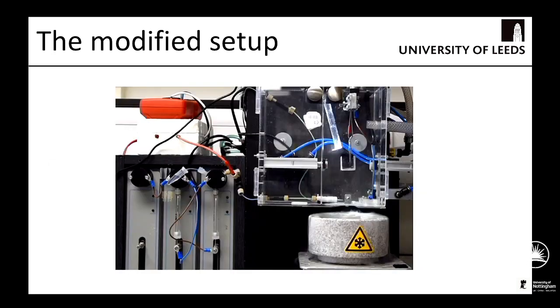And so what does this thing look like? Well, this is it in action. So this is on a loop. We obviously don't go up and down, that would be insane. But you can see roughly how quickly this goes. And then these are the syringe drivers here, dropping it through.